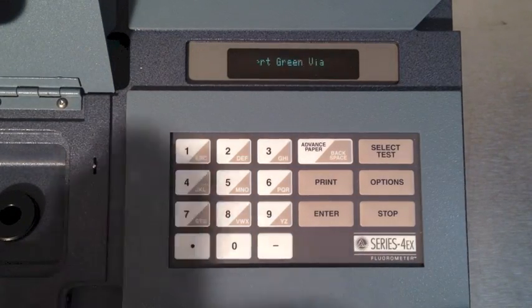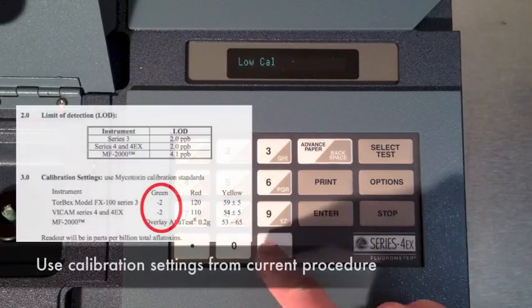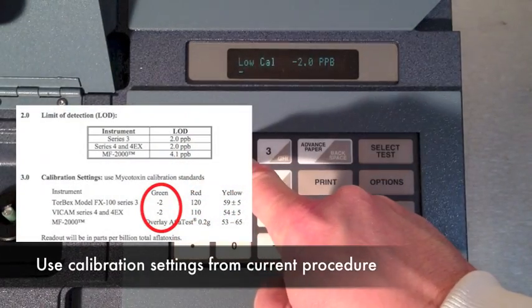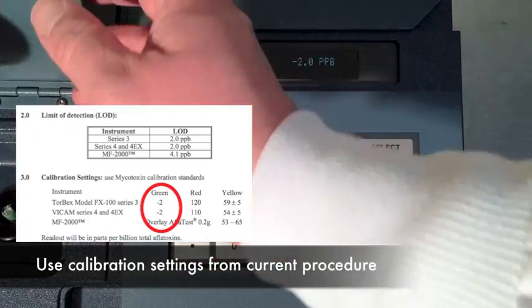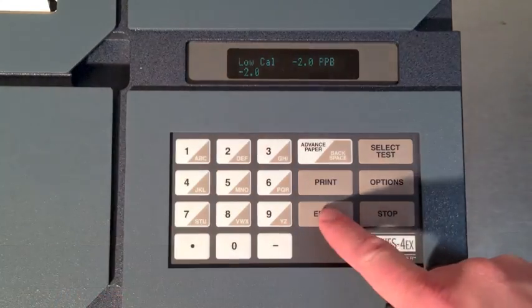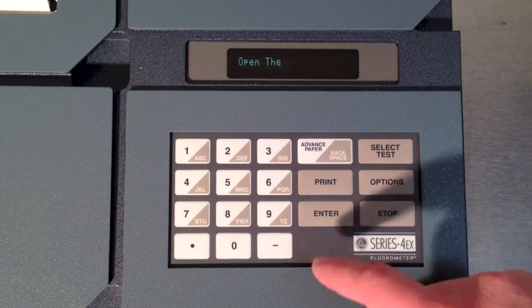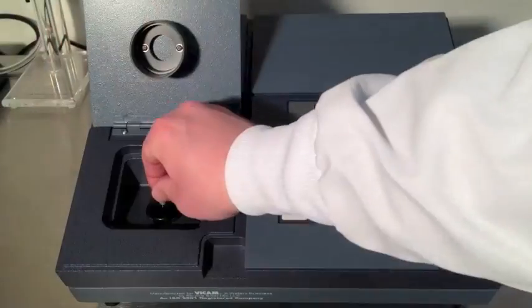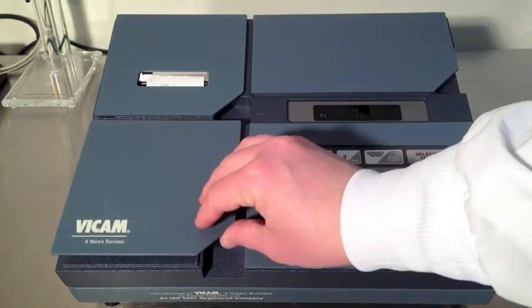The display will prompt for the green calibration setting. Refer to the current procedure for proper calibration settings. Press Enter to accept the setting. The machine will then click several times and you'll be prompted to remove the second vial. The fluorometer will print out a time and date stamped record of calibration.